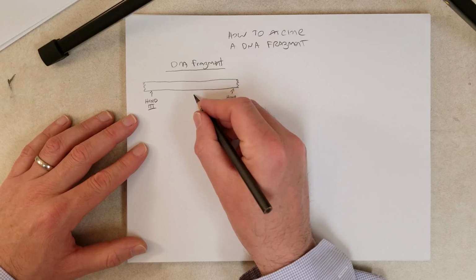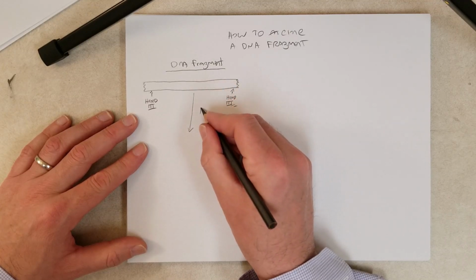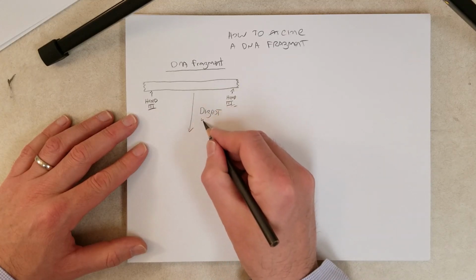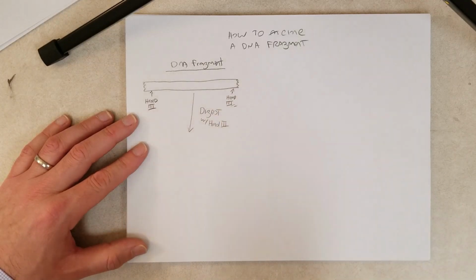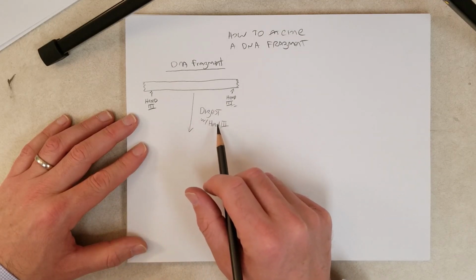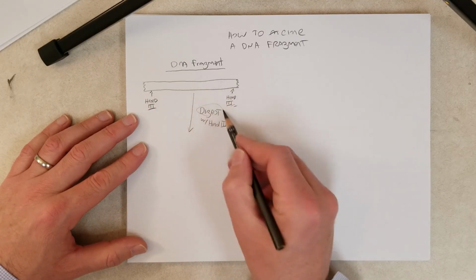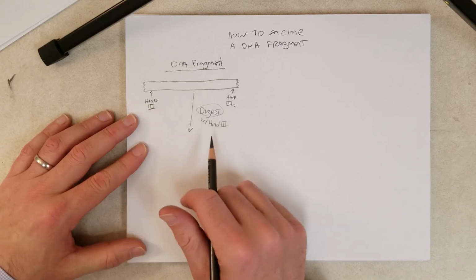Okay, so first thing we would do is digest the DNA with HindIII, with the HindIII enzyme. So the DNA is in a solution of water, we add a buffer that is compatible with the enzyme, and we add the enzyme. And the enzyme will cut the HindIII sites on the ends, and digest is just a word that we can use interchangeably with cut. So cut the DNA or digest the DNA with HindIII.